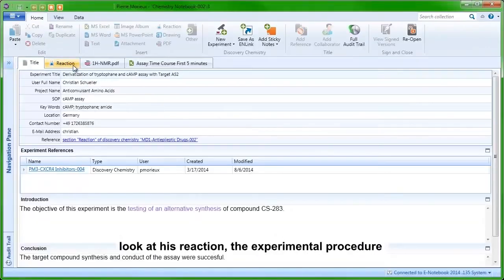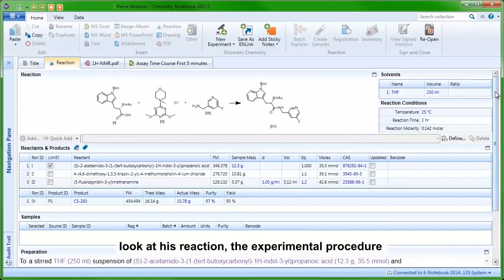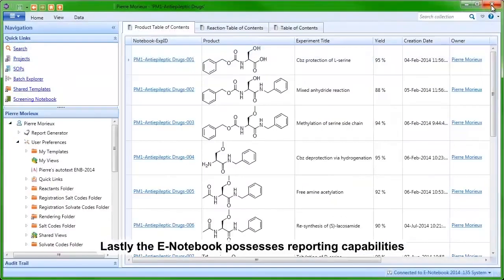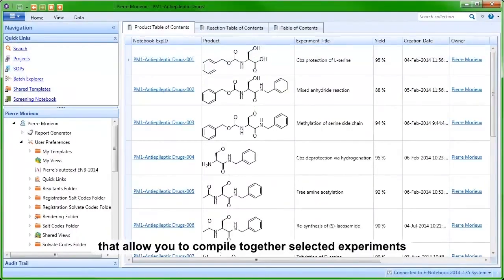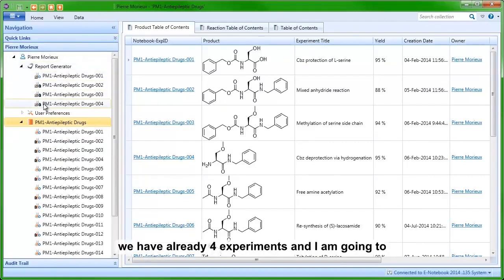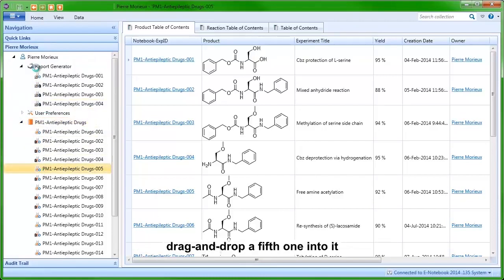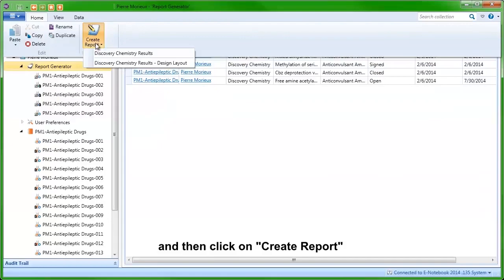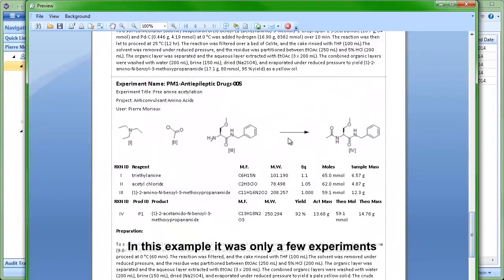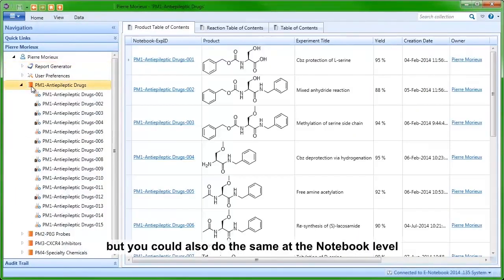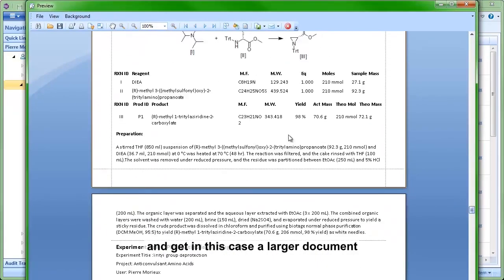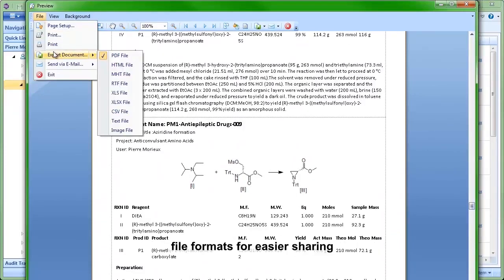If I click on that link, I can have a look at my colleague's reaction, the experimental procedure, as well as, for example, a proton NMR PDF. Lastly, the notebook possesses reporting capabilities that allow you to compile together selected experiments. In the report generator, there are already four experiments, and I'm just going to drag and drop a fifth one into it, then click on Create Reports, which compiles these five experiments into one document. You could also do the same at the notebook level and just print a report out of an entire notebook, getting a larger document which you can readily export to different file formats for easier sharing.